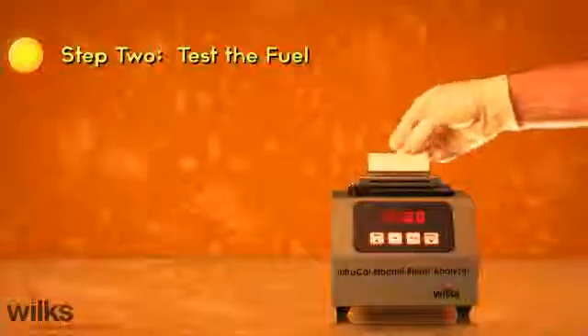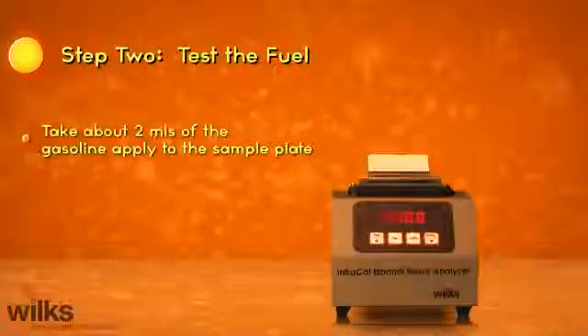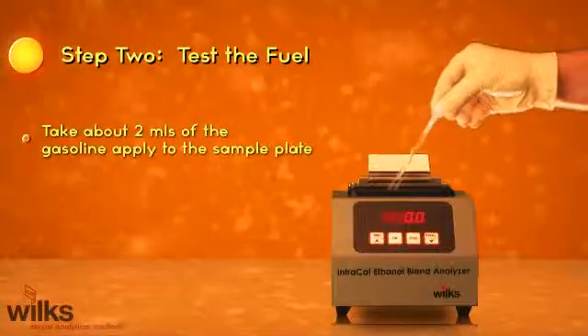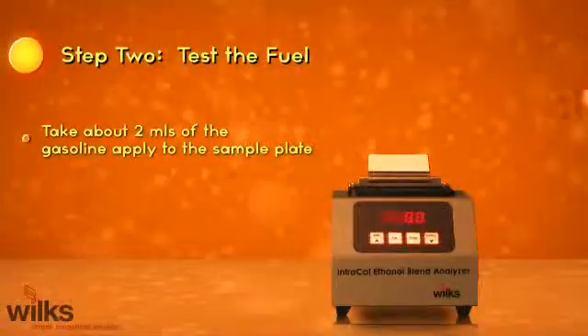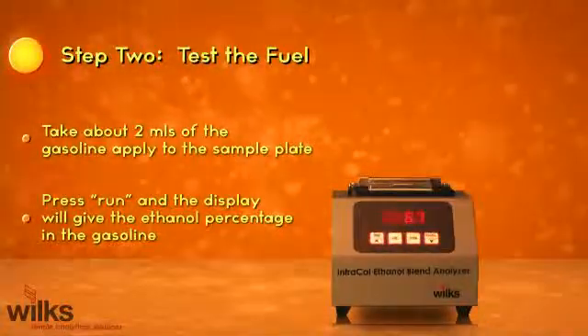Step 2: Test the fuel. Take about 2 milliliters of gasoline and apply to the sample plate. Press run and the display will give the ethanol percentage in the gasoline.